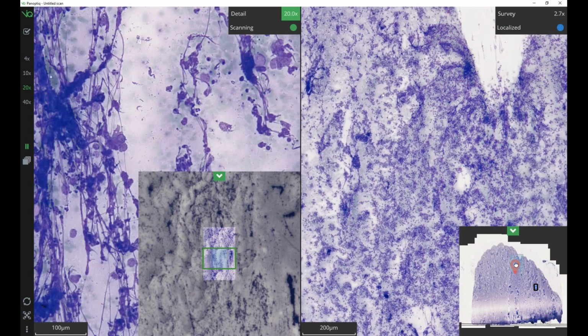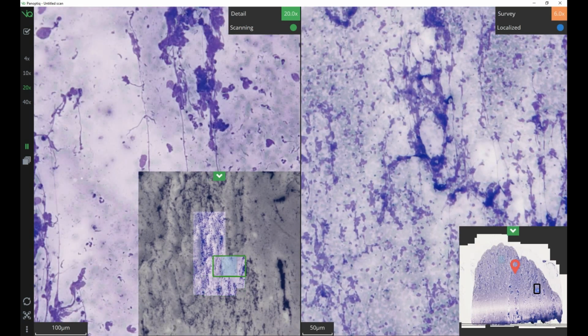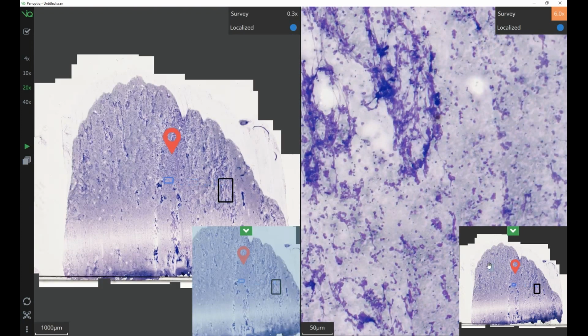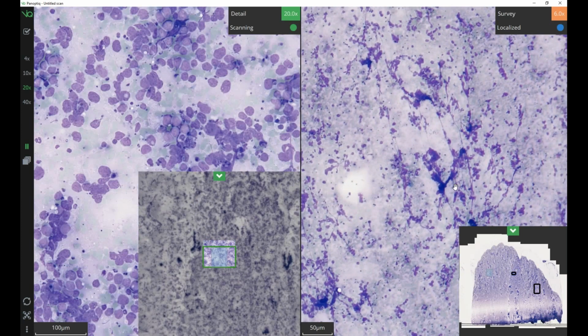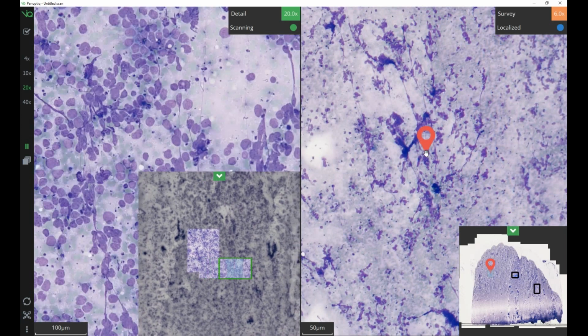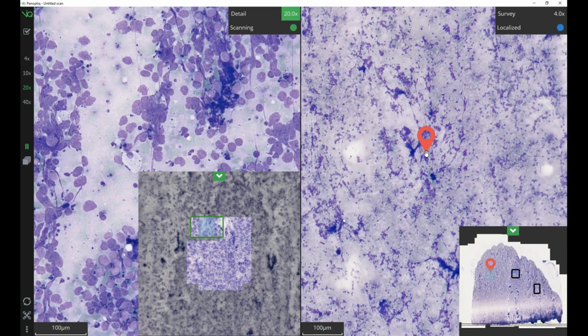and continue to pan around, zoom in, and look at another area. Potentially, instead of having a higher magnification, I can drop an annotation marker to generate a Z-stack in that area.